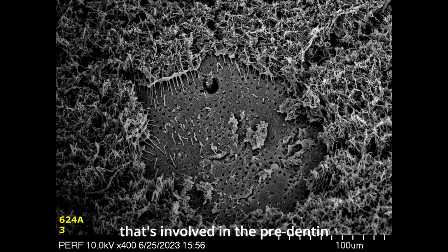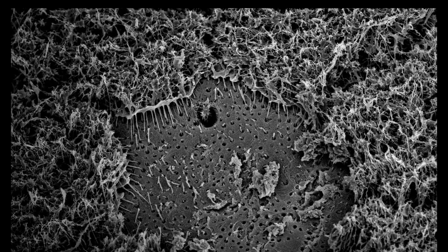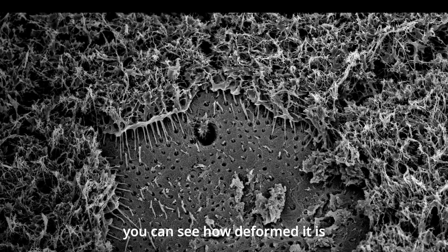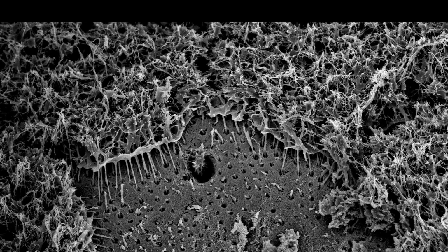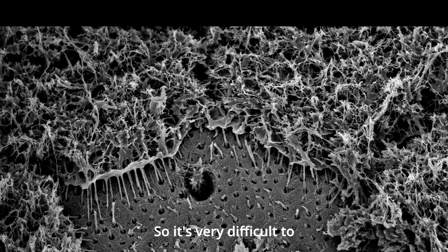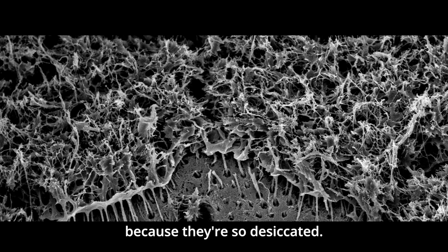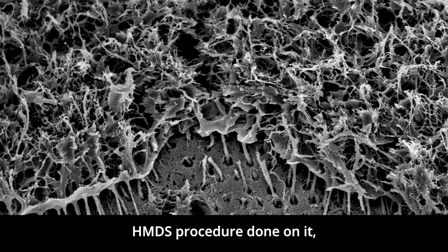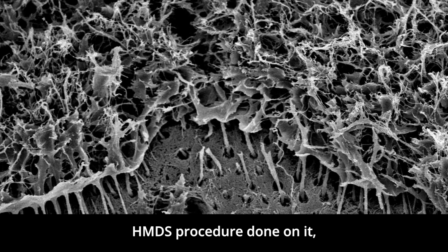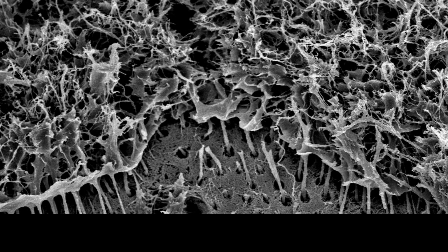And when you look at all that tissue that's involved in the predentin, and probably the odontoblast cell layer, as well as some pulpal tissue, you can see how deformed it is just from the alcohol dehydration. So it's very difficult to recognize any real structures because they're so desiccated. Even though this did have an HMDS procedure done on it, there's no way of really avoiding the dehydration effects.